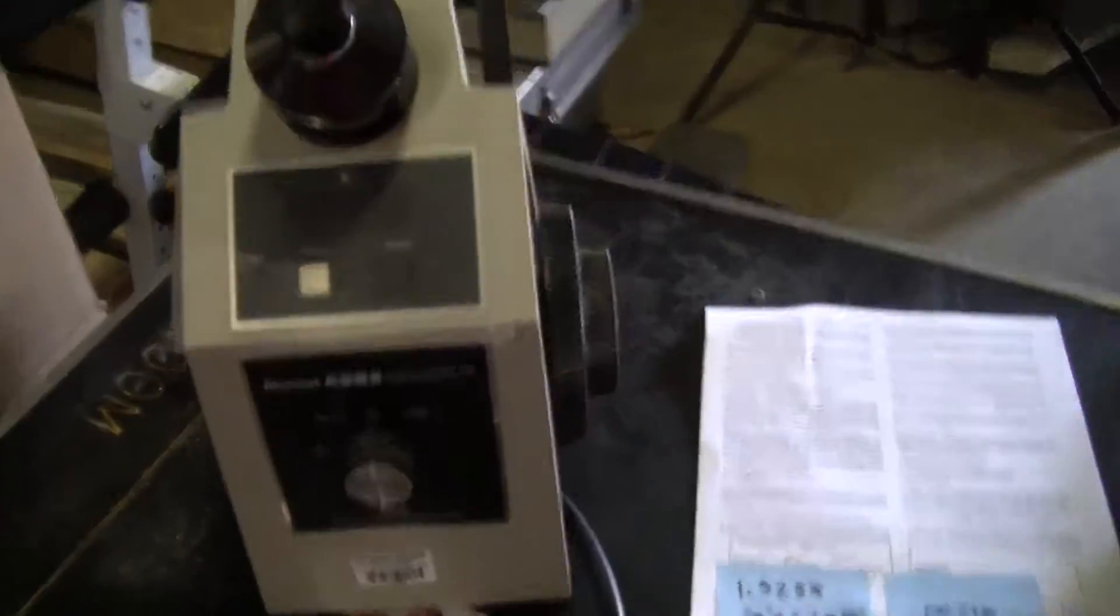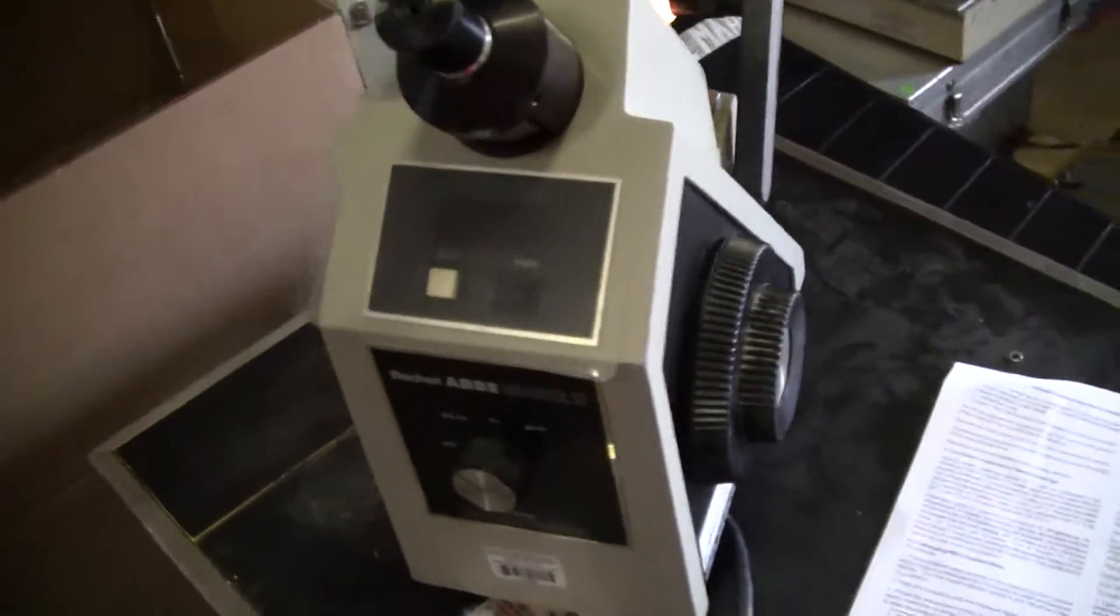Hi, this is Michael from Hitech Trader. Today we're looking at the Abbey Mark II. This instrument is ready to go out.